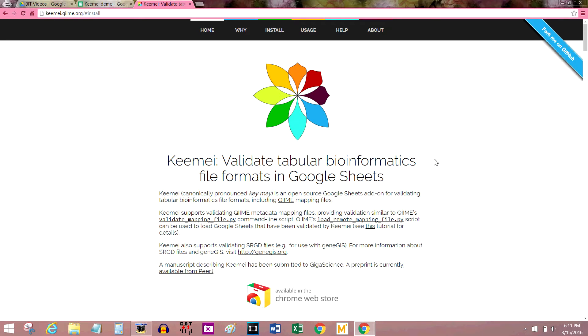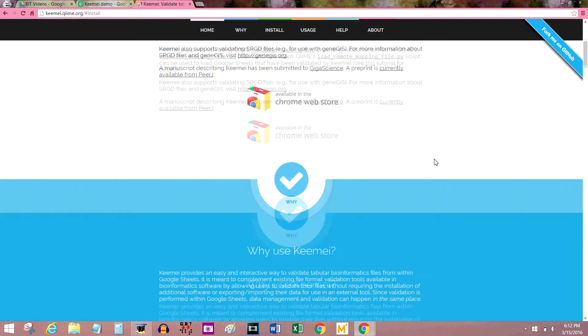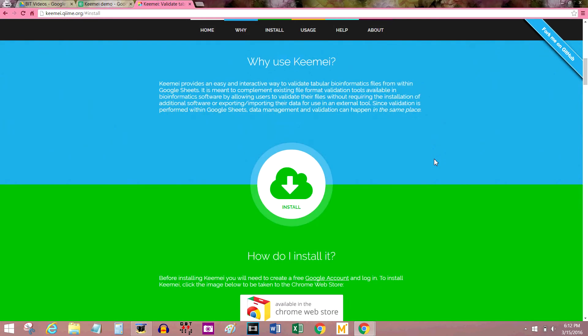So what you're going to need for this installation is a computer obviously. You're also going to need a Google account — you can make one for free if you don't have one already — and that's actually it.